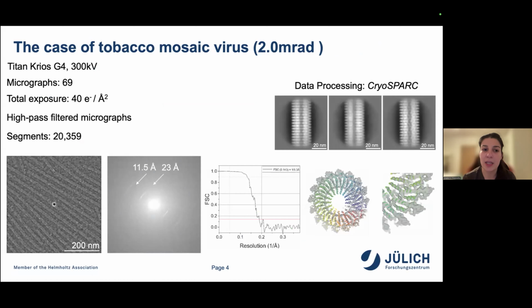So, here, in this experiment, we have used the tobacco mosaic virus as specimen. We know its helical structure, and in this case, the convergence semi-angle that was used was set at 2 millirad. The experiment has been performed on a Titan Krios at 300 kV, and the micrographs have been manually collected. And you can see the amount of micrographs that have been collected.